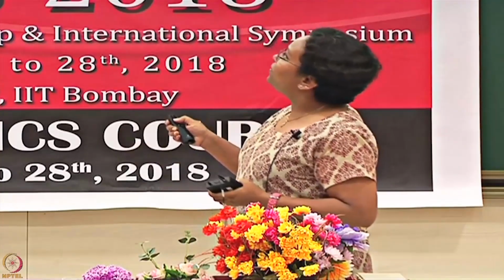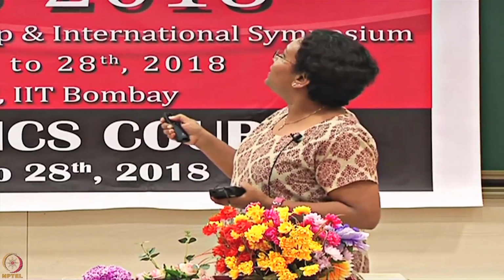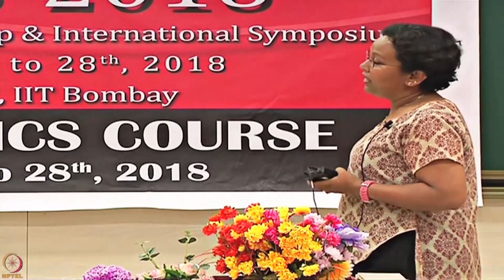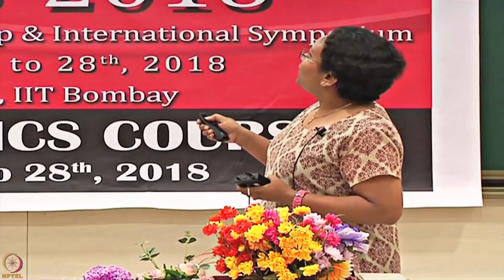You mix them. In the earlier case the binding was happening in solution, but here there is no binding in solution. When you put this mixture on your surface where your ligands are bound, you see the binding only because of your competing analyte. When these analytes are so small and negligible, you do not get to see binding.